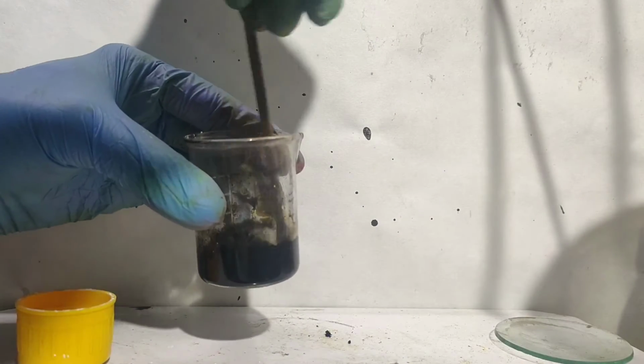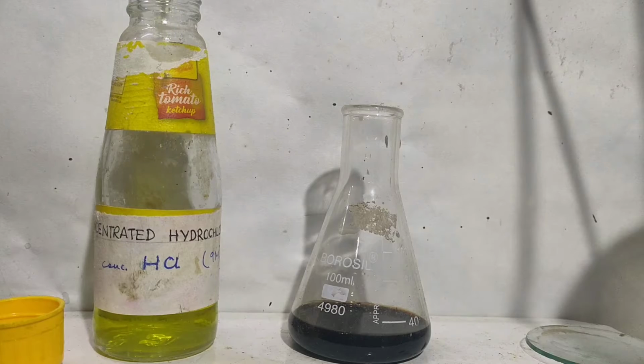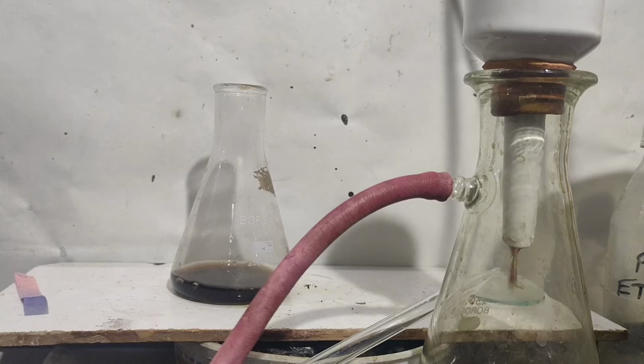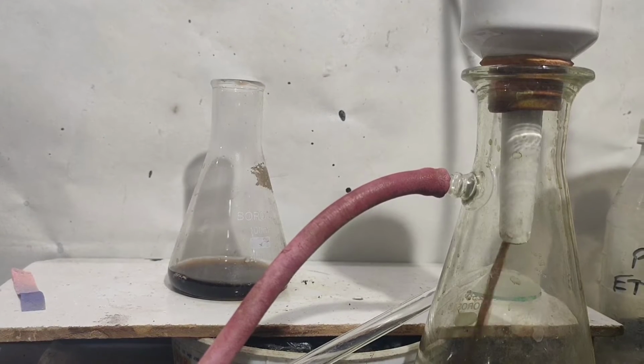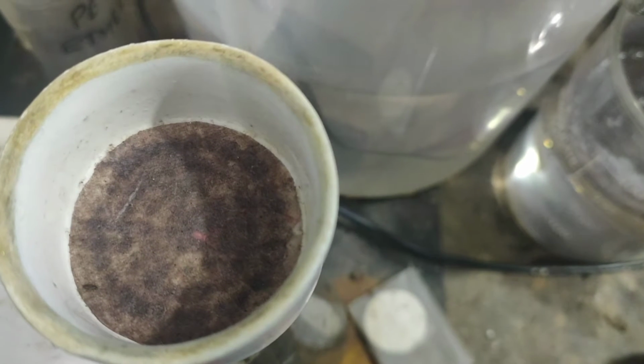The filtrate came as a black solution. To the filtrate, I added HCl until the solution was acidic and filtered it. No solid residue was obtained. The reaction was a complete failure.